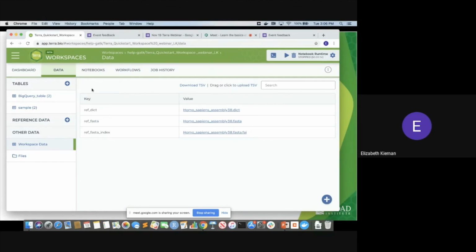And if you have any questions more about data tables and populating this, Anton can also answer that a little bit more in detail at the end of this webinar.